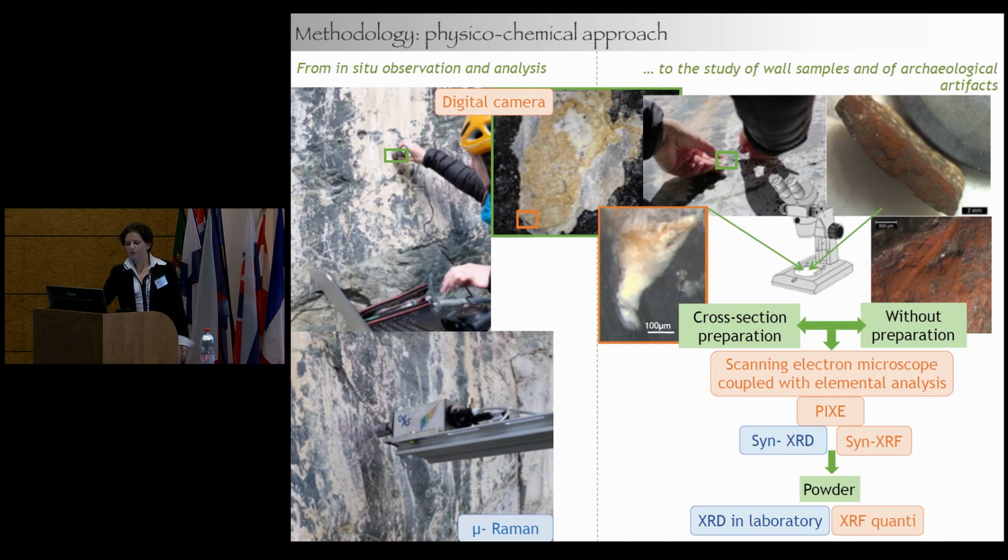So first, we try with a digital camera and portable instruments such as Raman spectroscopy to study the paint directly in situ.